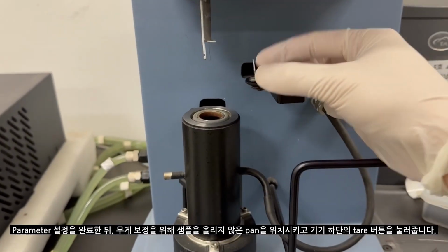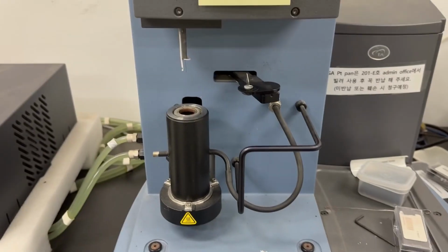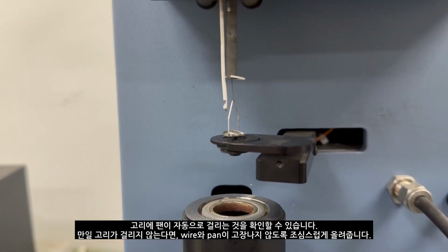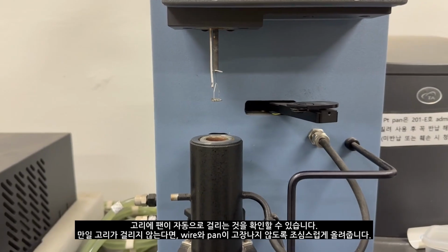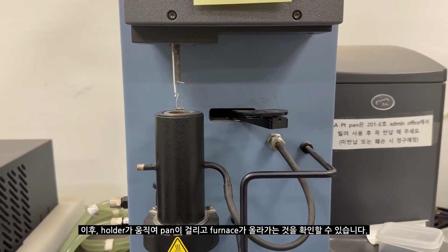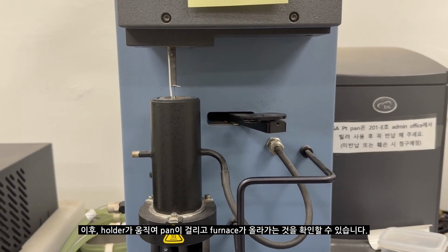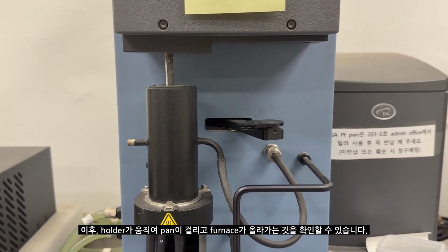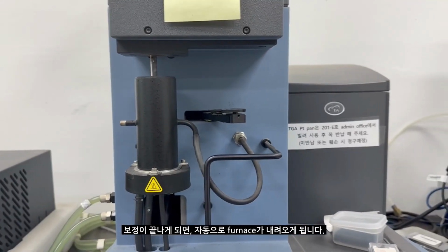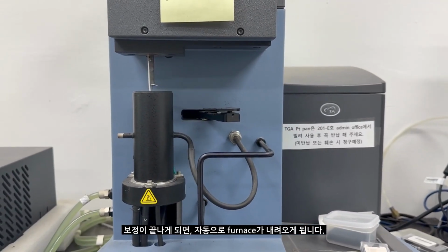To calibrate the scale, lift an empty pan and press the tare button. Hook will engage automatically. If not, carefully place the pan on the wire. Afterward, the pan is suspended and the furnace ascends. The furnace descends automatically when the calibration is done.